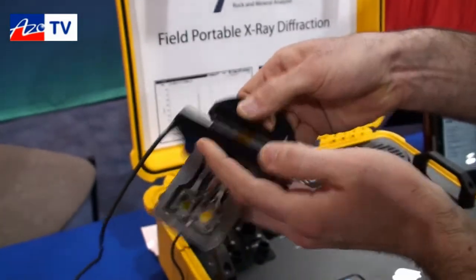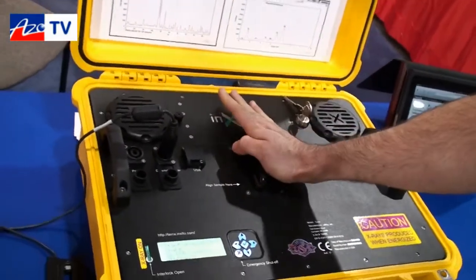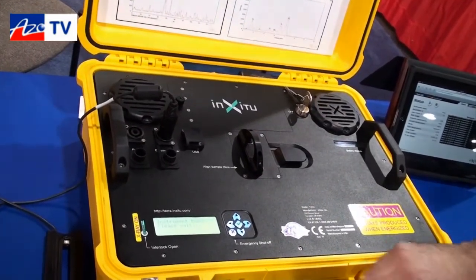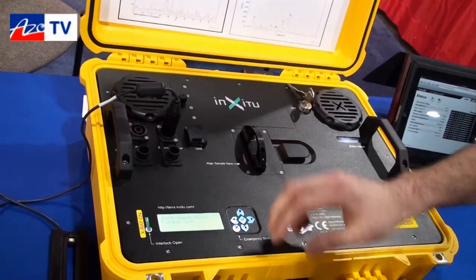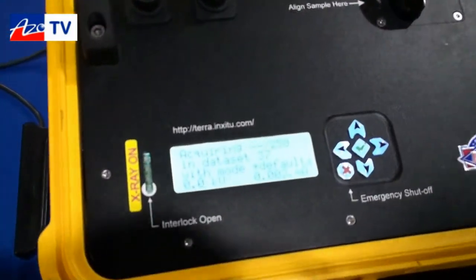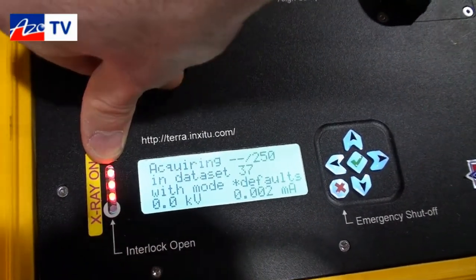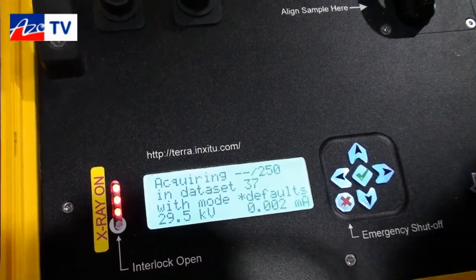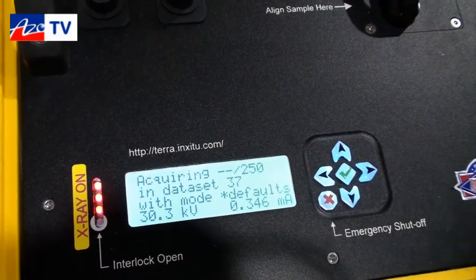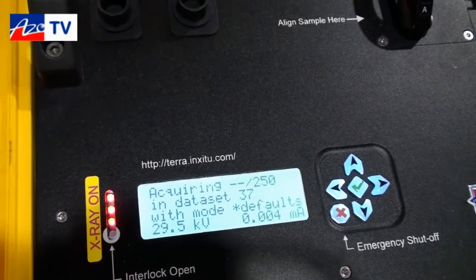Once it's loaded, you can stop it, insert it back into the instrument, and start an acquisition just by hitting go. The instrument will start up — you'll see that it's all safely contained. There's no need for a cooling system or anything like that. We have x-ray lights that will show on right here. After about 15 seconds, we'll have our first diffraction pattern.